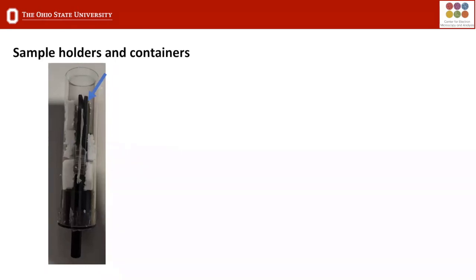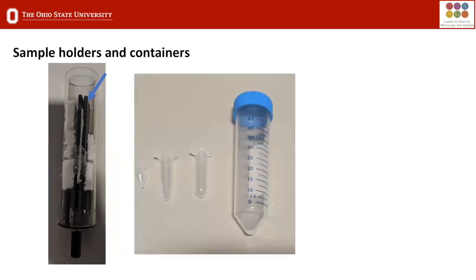As well as sticking samples to a post, you can also mount them in a holder or a container. Here you can see a photo of 2 phone batteries that have been placed in a sample holder, and then the holder has been padded out with some pieces of styrofoam to make sure the sample doesn't move. You can also use containers found around your lab, like the one shown in the photo. To load the sample into the CT, once you have them in these containers, you'll have to stick them to some sort of post.